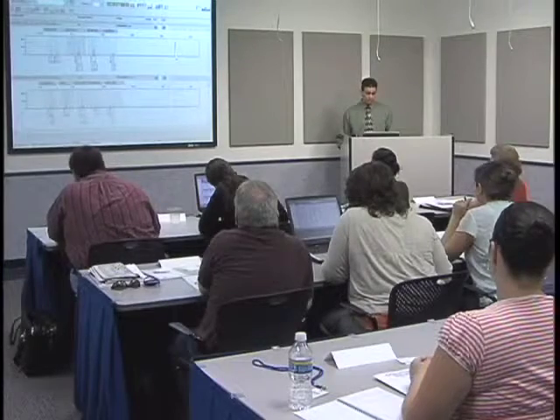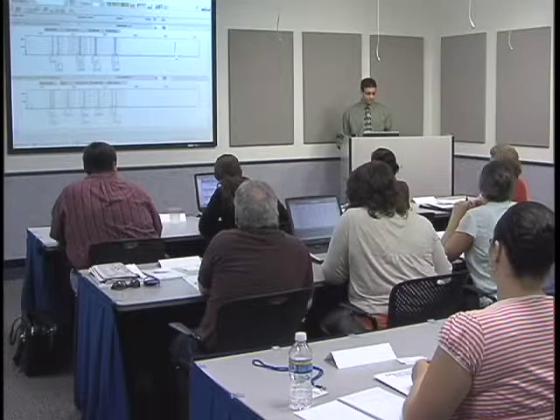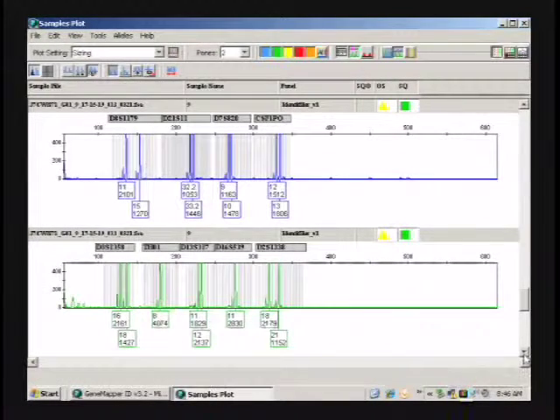And have you looked at it by increasing, not taking it to such an extreme where you're going from 1 to the max of your amplicon, but increasing your amplicon to like 2-3 microliters? Is that what you showed us? Yeah, we had some data on that where I only took some of my amplicon and ran it through the process, and then I took all of my amplicon, ran it through the process, and only added some of it onto the instrument. And I think that's what you're seeing here with the people who only added 1 microliter. They may be still getting an increase, it's just not as high. Now this one, number 9, was originally a 0.1, and this is extremely high.